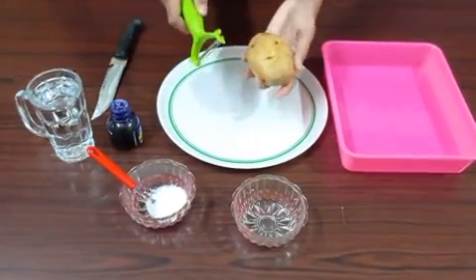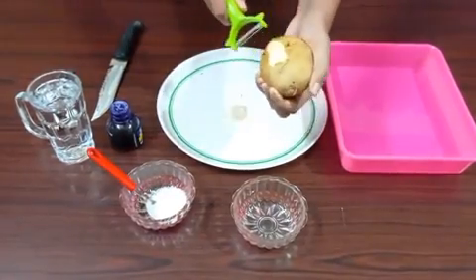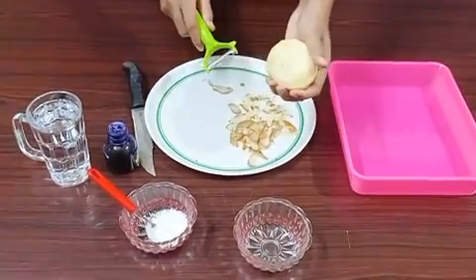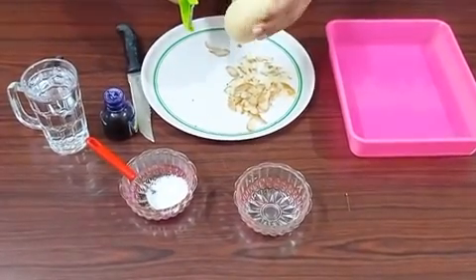Now we can take the potato and peel the skin of the potato like this. Now I have peeled the skin of the entire potato.